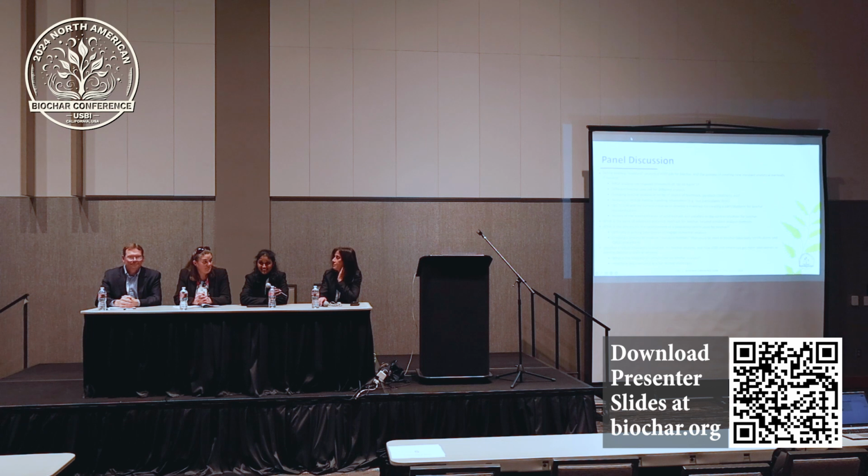Maybe I can, because if you're measuring so many samples, moisture is something that needs to be corrected for any kind of analysis if we have to report on a dry matter basis. And that's the standard method of reporting for any analysis. So yeah, we follow the same protocol as Chris was mentioning.